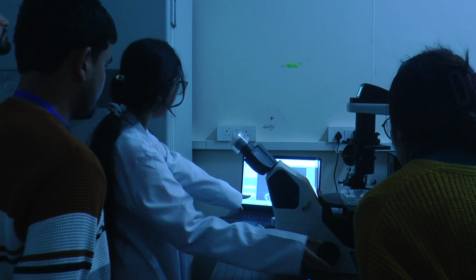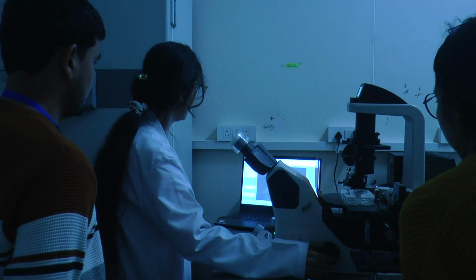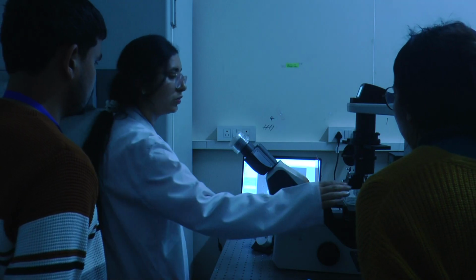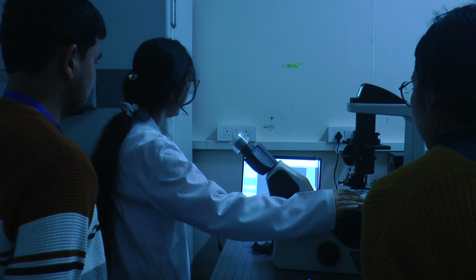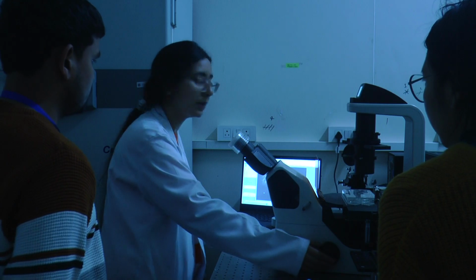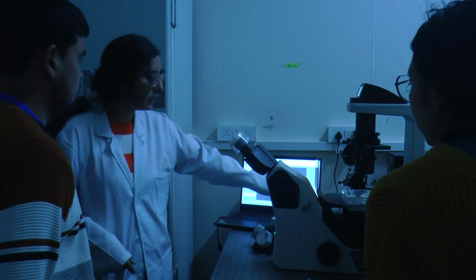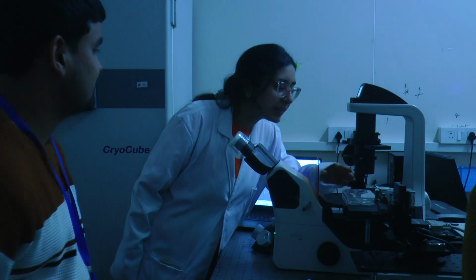It detached from the surface, but this GPMV is the free one. Actually, the cell confluency was a little less in this, so we are getting a smaller number. Like I showed you the other flask, this one had more because the confluency was more in this.